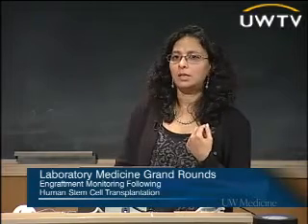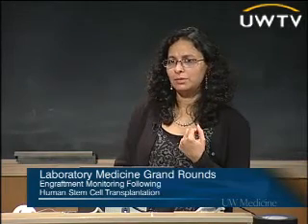You're talking about the standard STR? Yeah, the standard STR one. You can easily differentiate between 5 and 10%. We can't go below that; our sensitivity level peaks out at about 3%. So then, in answer to Dr. Sabo's question, you're saying it is quantitative?